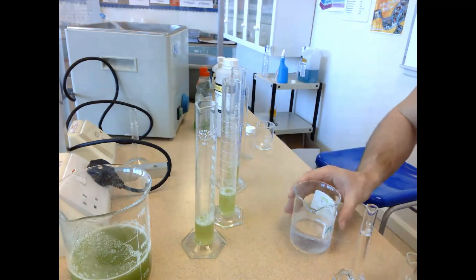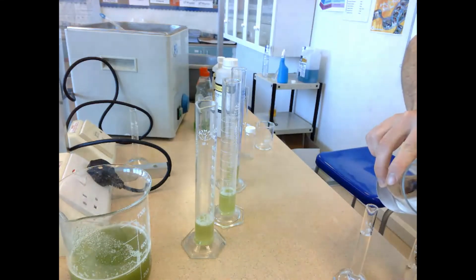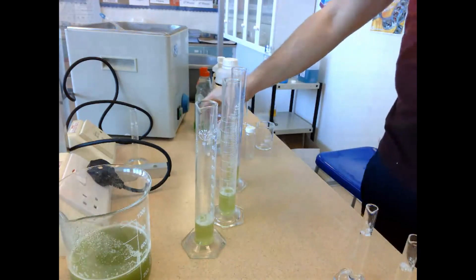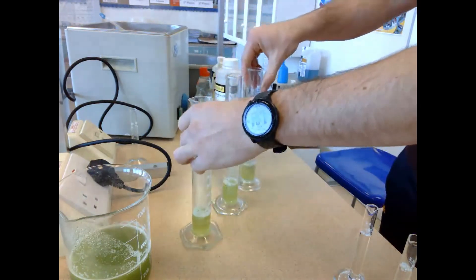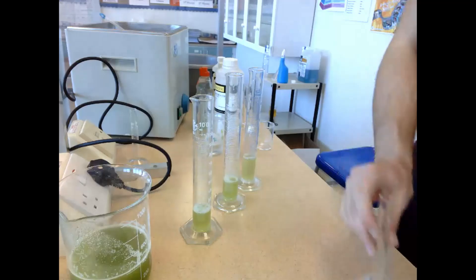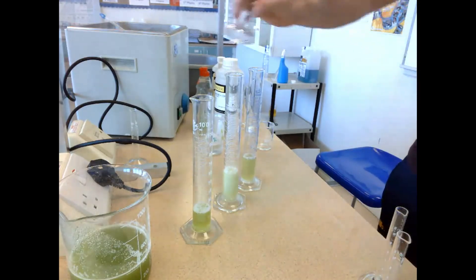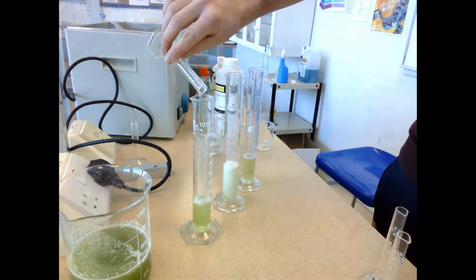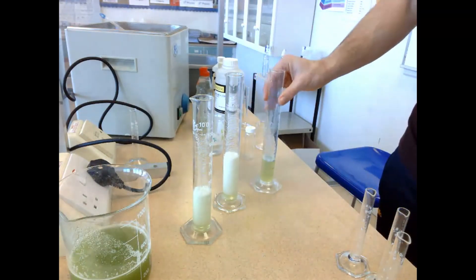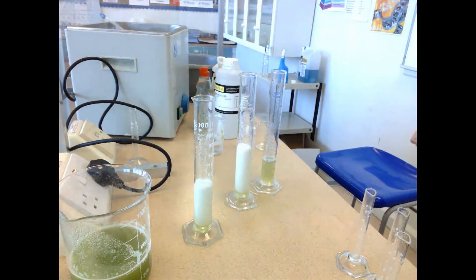I'm measuring out the hydrogen peroxide. Once that's done I add it into the individual graduated cylinders. These three graduated cylinders with 10 millilitres of hydrogen peroxide are ready to go. I'll add them into each graduated cylinder and note the time so that after a minute I can register the volume produced. So — 10 millilitres of hydrogen peroxide into pH buffer 3: not much reaction. Into pH buffer 9: straight away foam starts to be produced. Into pH buffer 12: foam starts to be produced pretty much straight away.